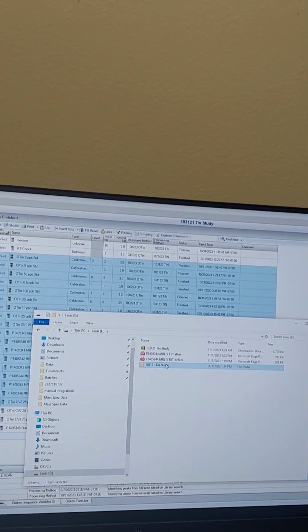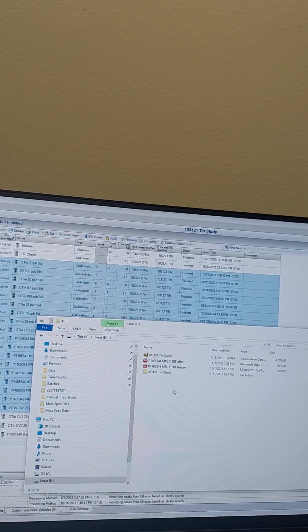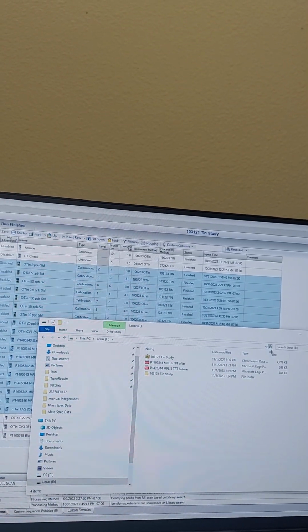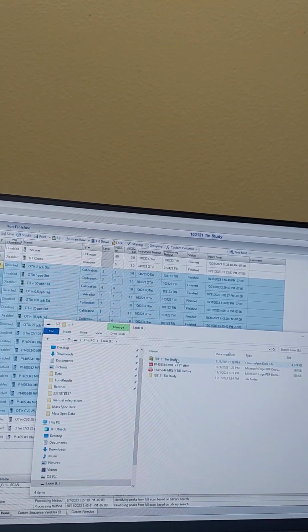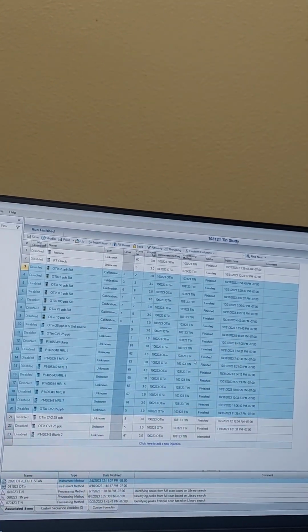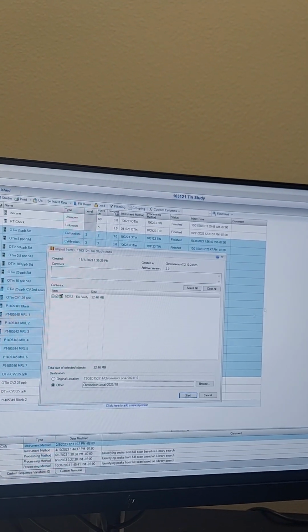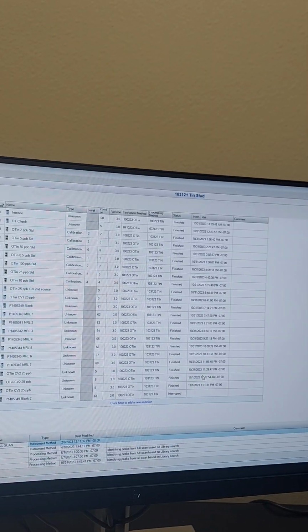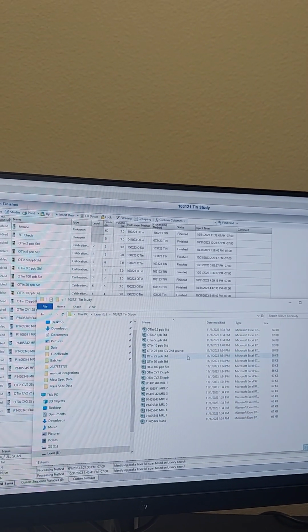I don't see it. I also don't see it. Whoops. Maybe we don't need it. You think so? It's probably in here.